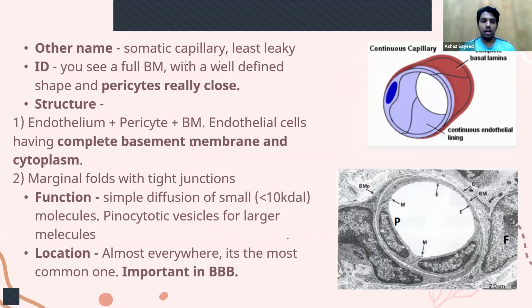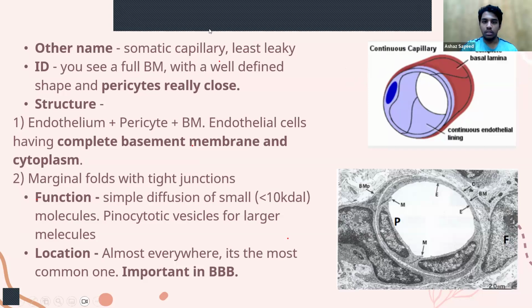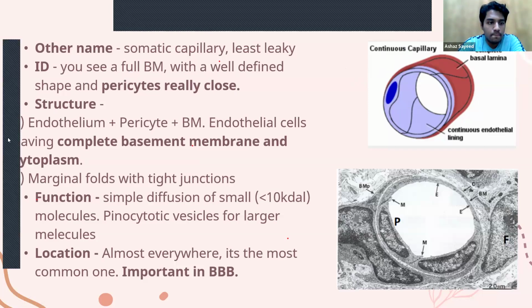For identification of the continuous capillary, it has another name, the somatic capillary, and these are the least leaky.